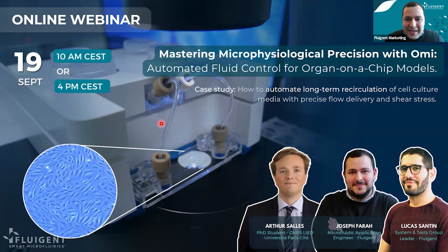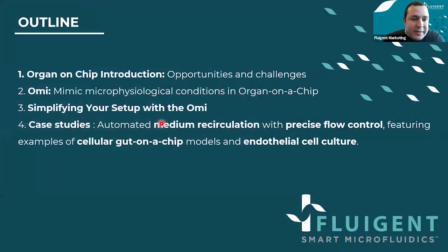So let's start today with the agenda of our webinar. We will start, first of all, with a small introduction about organ-on-chip, showing you the opportunities, promises, and challenges for this field. Afterwards, we'll present our latest contribution in this field by introducing OMI and its capacities to mimic microphysiological conditions in organ-on-a-chip.